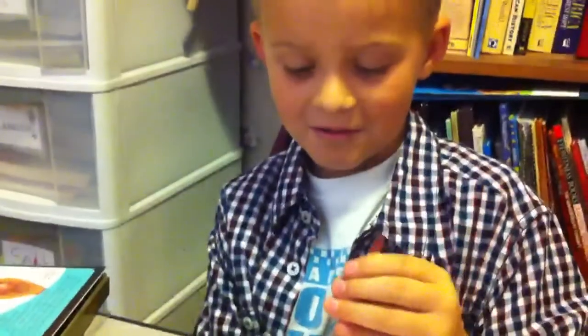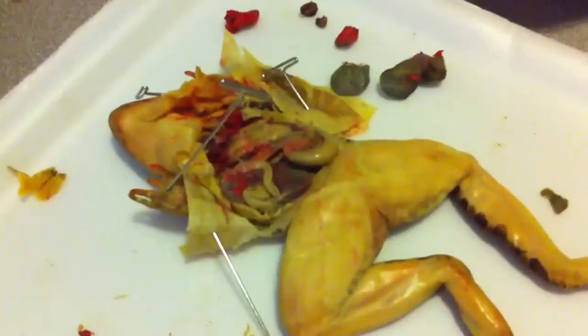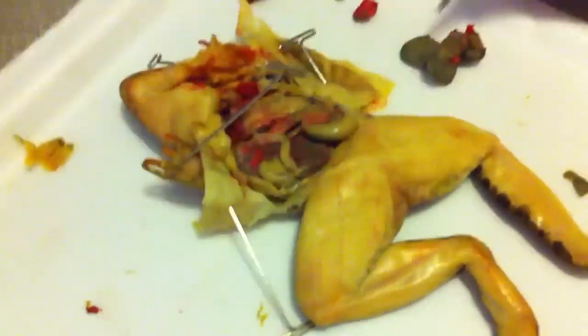This is a frog I'm doing. Lungs here's, heart here's, gallbladder, gallbladder here's. This is liver, three little liver.